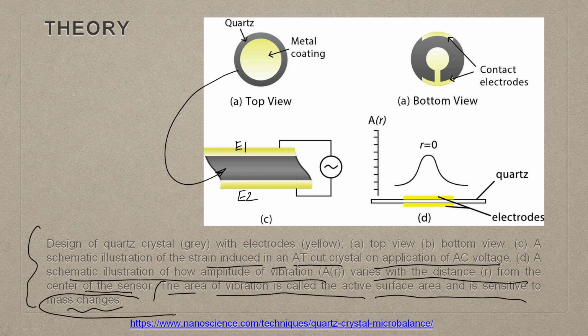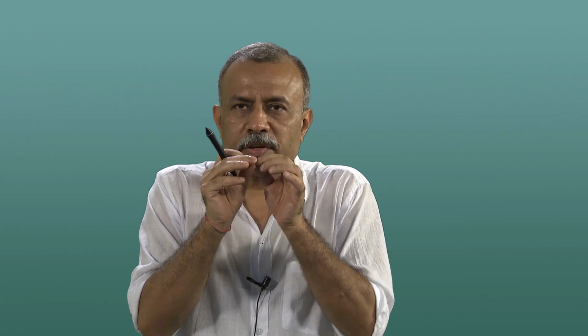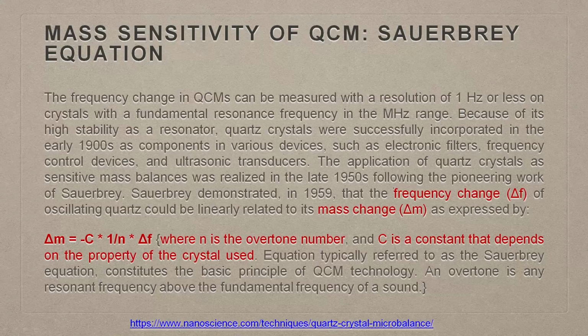So, an extremely important part is this part, exactly where the major sensitivity happens. The major sensitivity, as we look at it, is here, and it dampens down on both sides. Realize? So, it is at that peak, that particular node, you see the maximum. So, it is a function of the space. There is a unique active surface versus the corners where you do not see that kind of sensitivity.